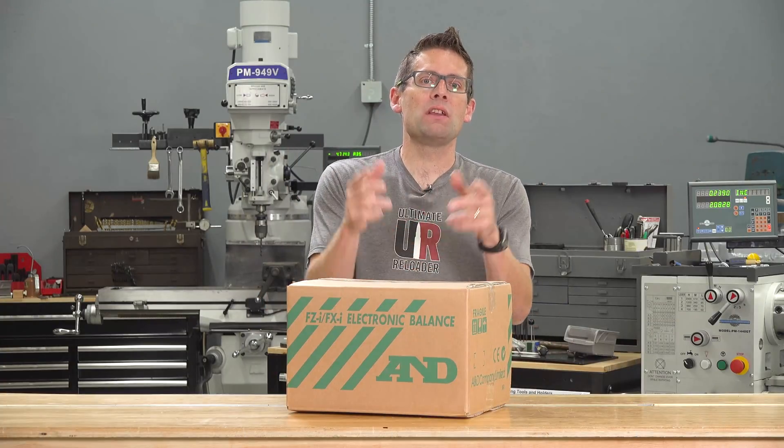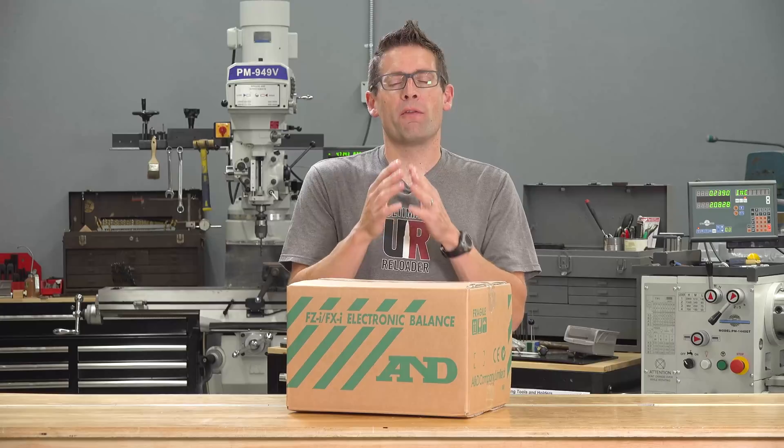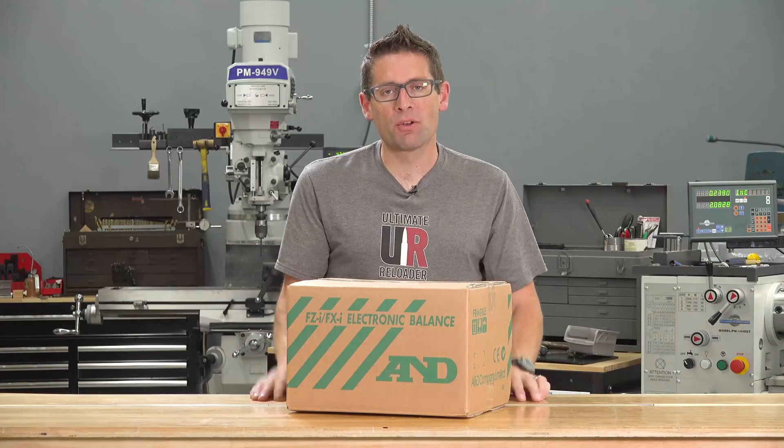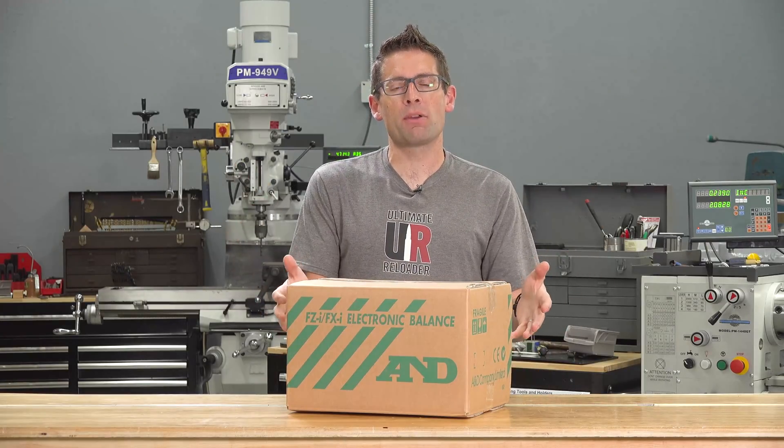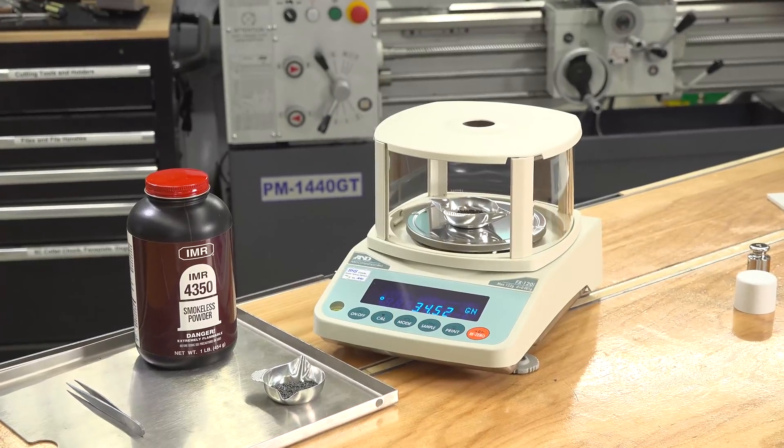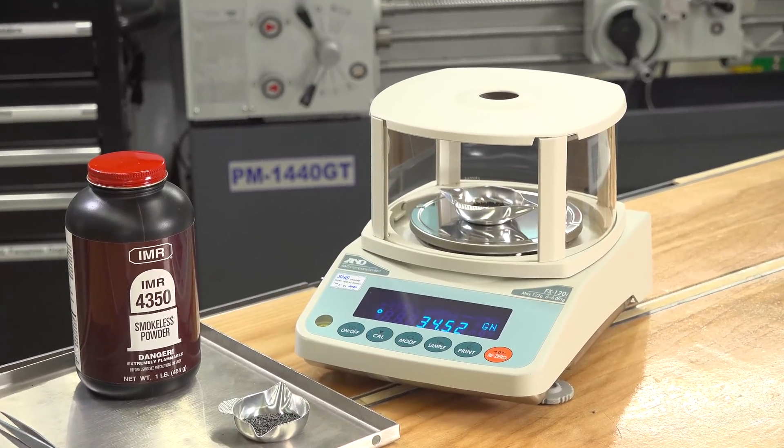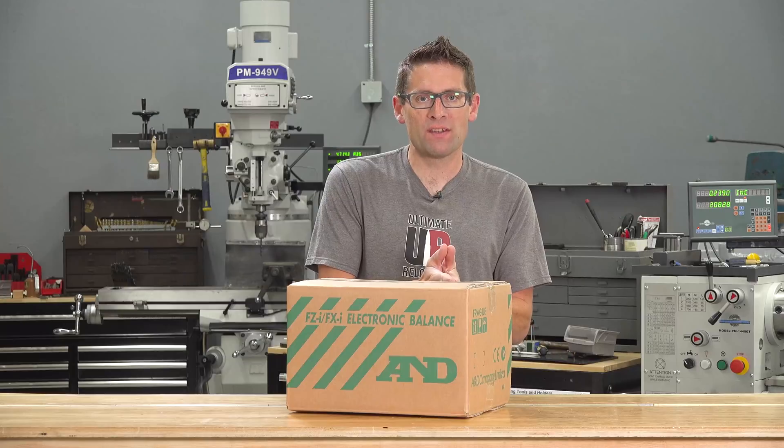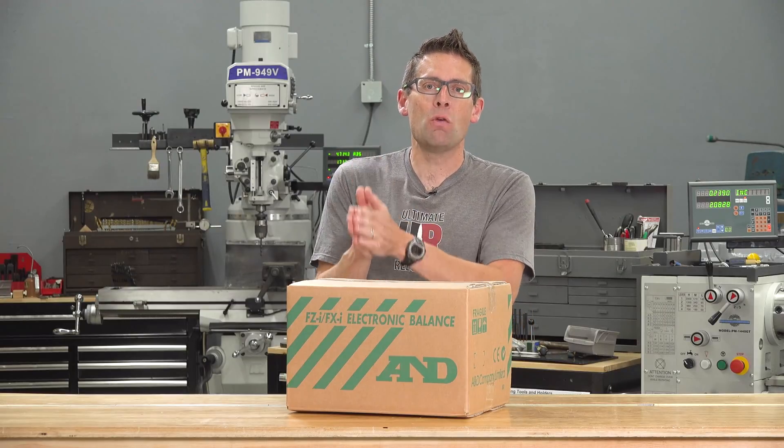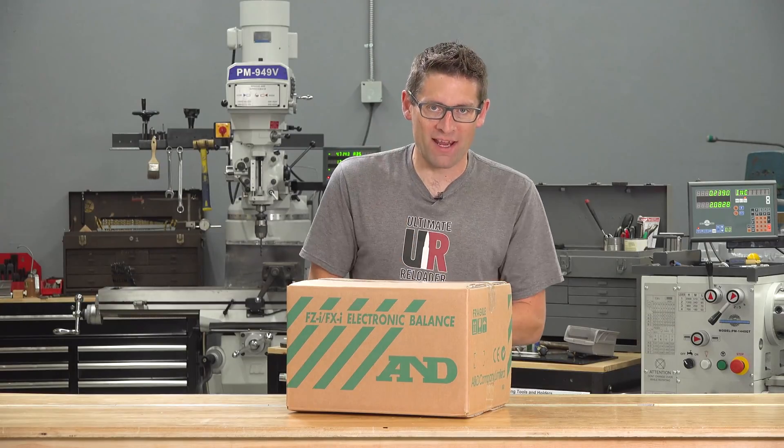If you're serious about long range shooting, you need a good scale for powder measurement. Gavin Gear here from Ultimate Reloader.com. In this video I'm going to show you the AND FX120i, which is the most cost effective laboratory grade scale that's accurate to two hundredths of a grain.